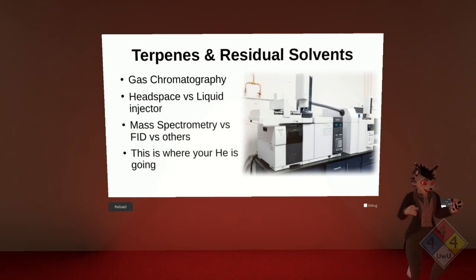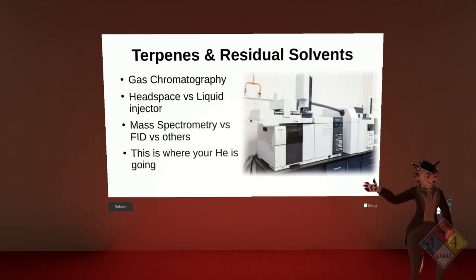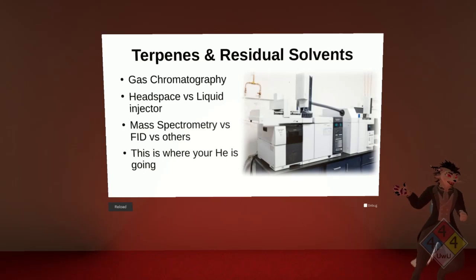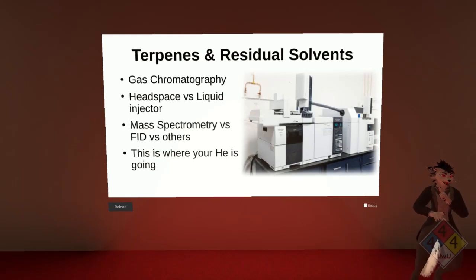And it gives certain things like ion selection, which in comparison, an FID is detecting how something interacts with a hydrogen flame. So it's detecting the electron flow, the electronic current that is developed from things interacting in a hydrogen flame, but from that you only have a single variable to work with, while the mass spec has a mass charge per time per signal, so you have an extra dimension to work with, which helps a lot with selectivity and allows you to deconvolute, simplify a complex mixture so you can actually get quantifiable accuracy on certain points.